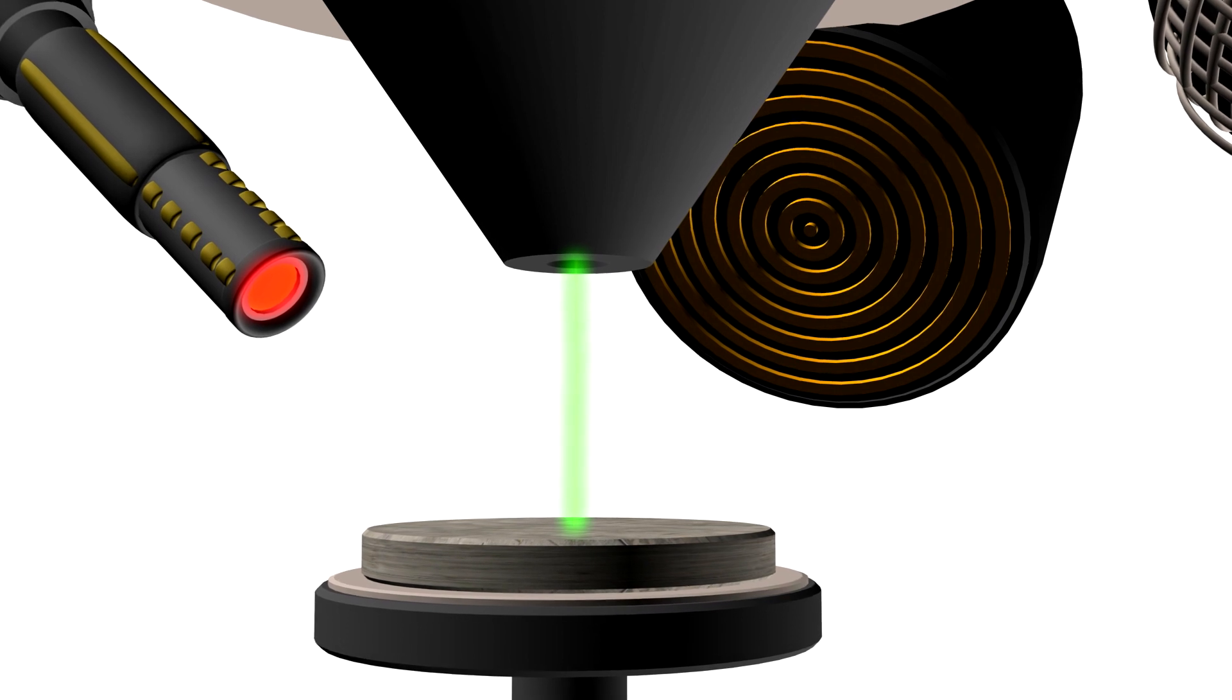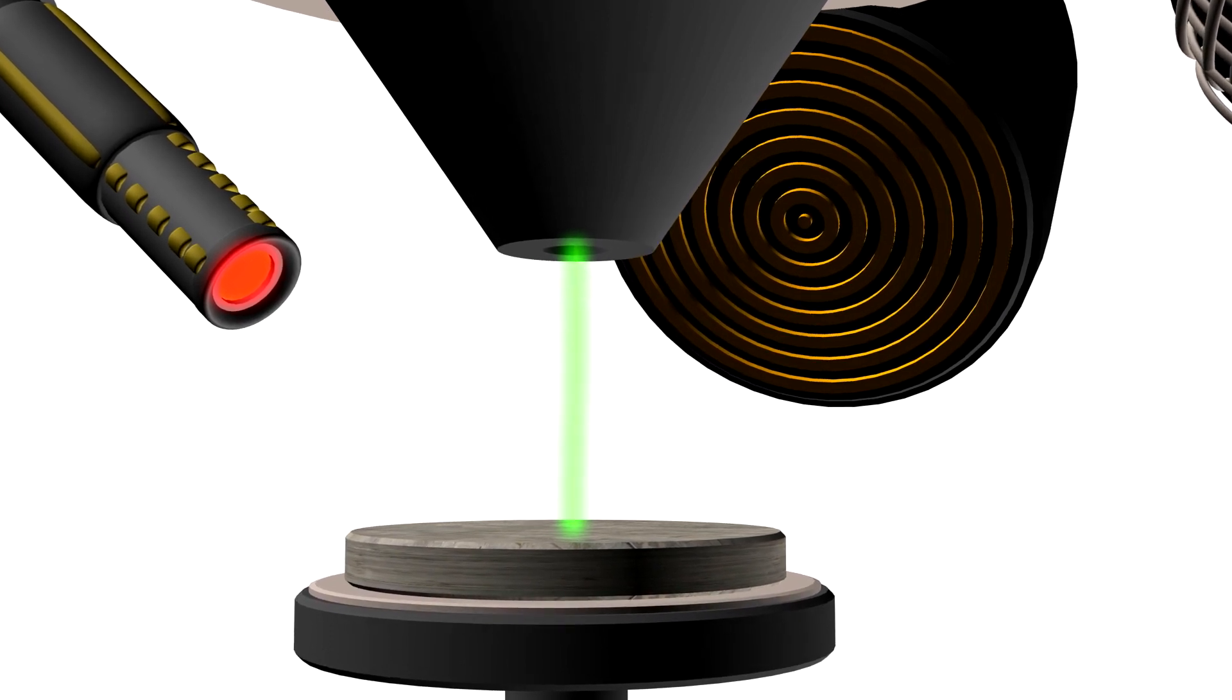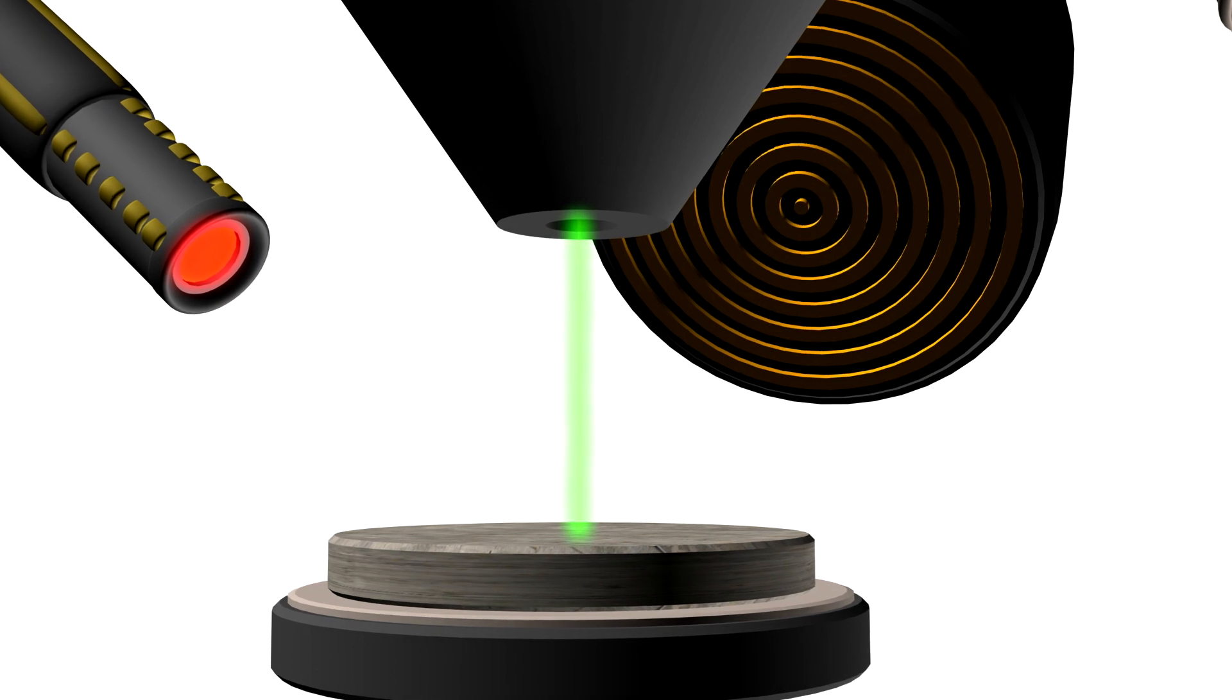As you saw, the center of the substrate has suffered most of the damage. And that's where we will try to make some high resolution images. We will also use energy dispersive X-ray microanalysis to find out what material we are actually dealing with.